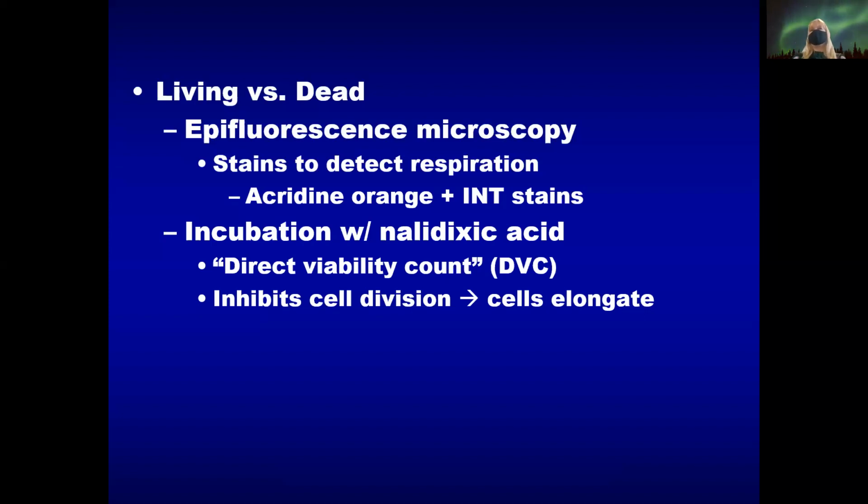You're looking at bigger cells, and that's a tip-off that they are alive and they're starting to go into cell reproduction. It's tricky. You really have to know your microbe, what it looks like normally, and then be able to pick out that it's getting bigger. That can be a little tricky.